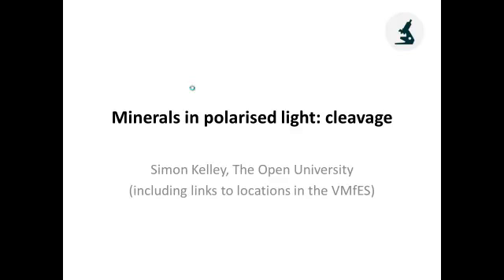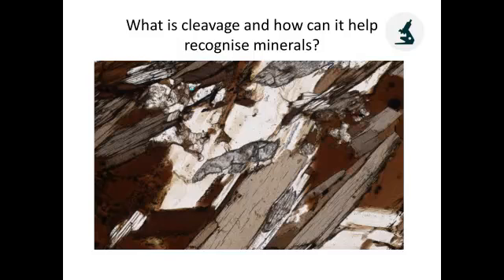Minerals in polarized light, cleavage. In this slidecast, we'll cover using cleavage to help recognize minerals in thin section. You very rarely just recognize a mineral based on cleavage. It's one of the things you use, but it can be really diagnostic.